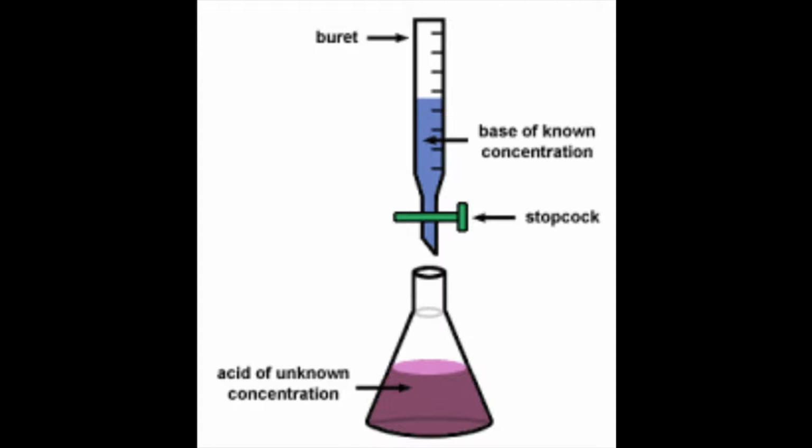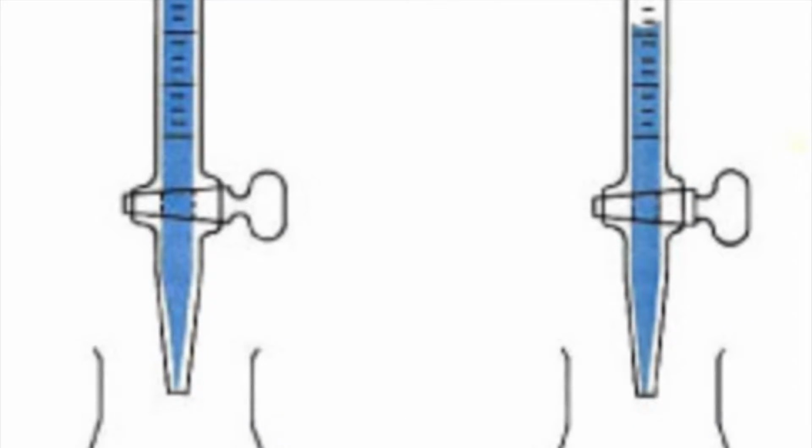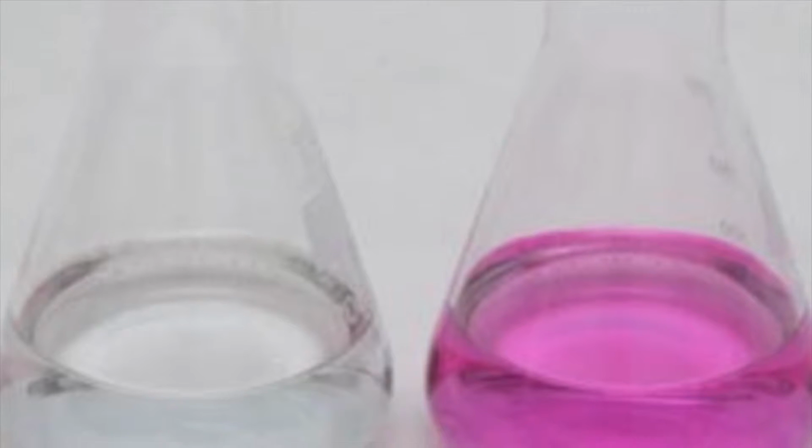The goal of this lab is to determine the unknown concentrations, the pH and the pOH of 3 different acids by titration. Titration means the determination of the concentration of a solution. The stage which shows the completion of a certain reaction is the endpoint. Equivalence point is a stage in which the amount of reagent added is exactly and stoichiometrically equivalent to the amount of the reacting substance in the titrated solution.